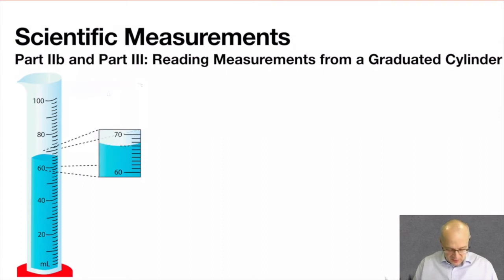Now, when you're measuring liquids from a graduated cylinder, you have to measure from the bottom of the meniscus, which is why on this zoom in here, the artist drew in these 3 dots to indicate that your eye should go to the bottom of this meniscus. Now let's look at what every one of these graduations mean.